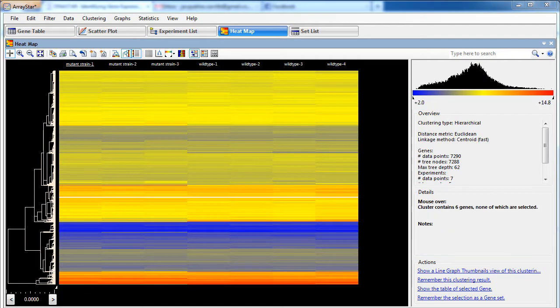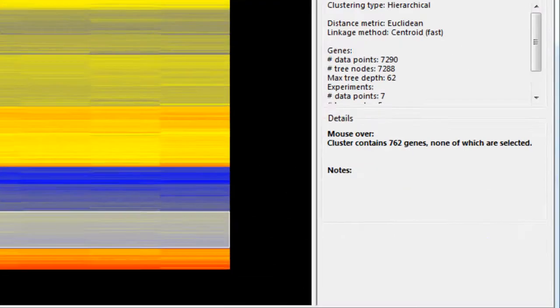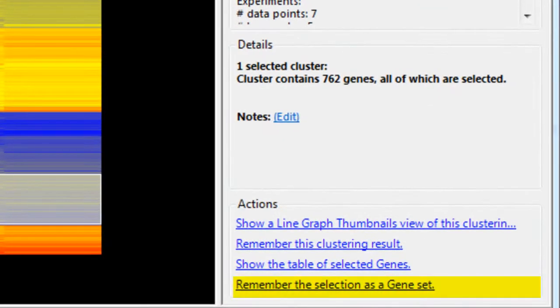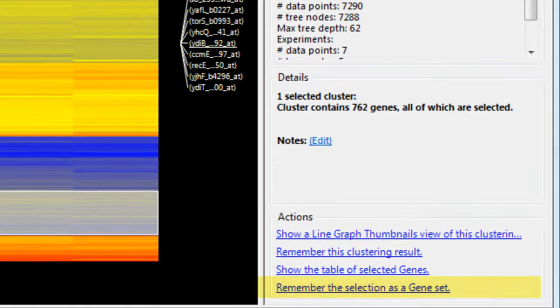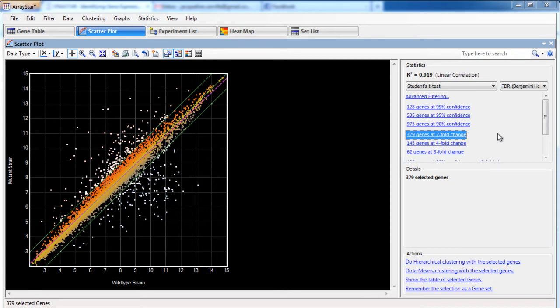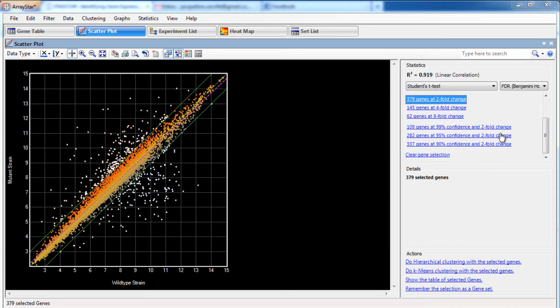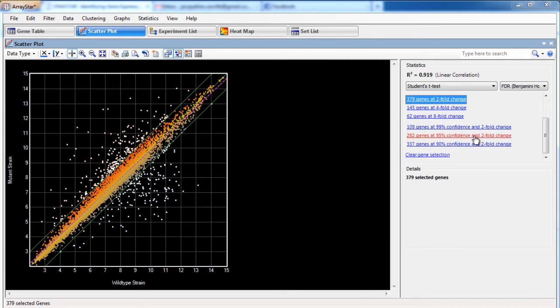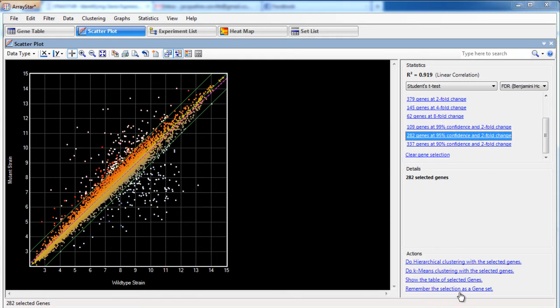Identify genes of interest and group them into gene sets as you work. Gene sets can be saved from any of the visualization methods available. For example, you can use the scatter plot to identify a group of genes that is up-expressed under a certain condition.